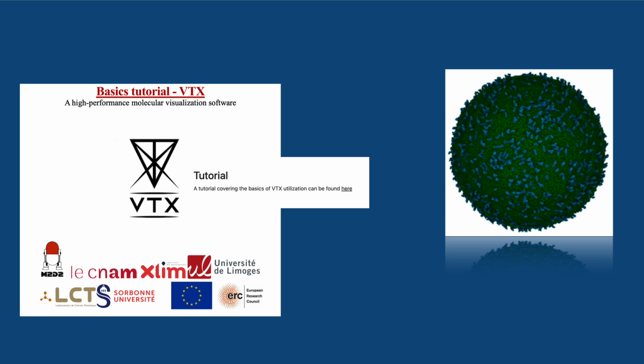There's the standard trackball camera rotation most people are used to, but they also added this really interesting free fly mode. Free fly? Yeah, like in a video game. You use keyboard keys, like WASD, to fly around inside the structure. Apparently, it's super useful for navigating these huge, complex systems. I can imagine. Especially with a whole cell model. Definitely. And they added keyboard shortcuts for common things, helpful if you're on a laptop trackpad. The whole interface is modular, too. You can dock panels wherever you want.